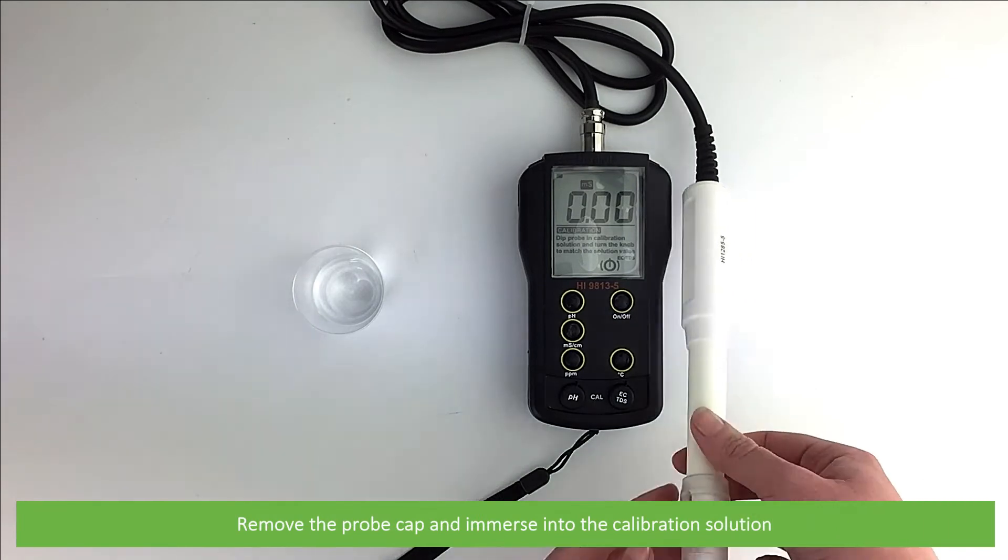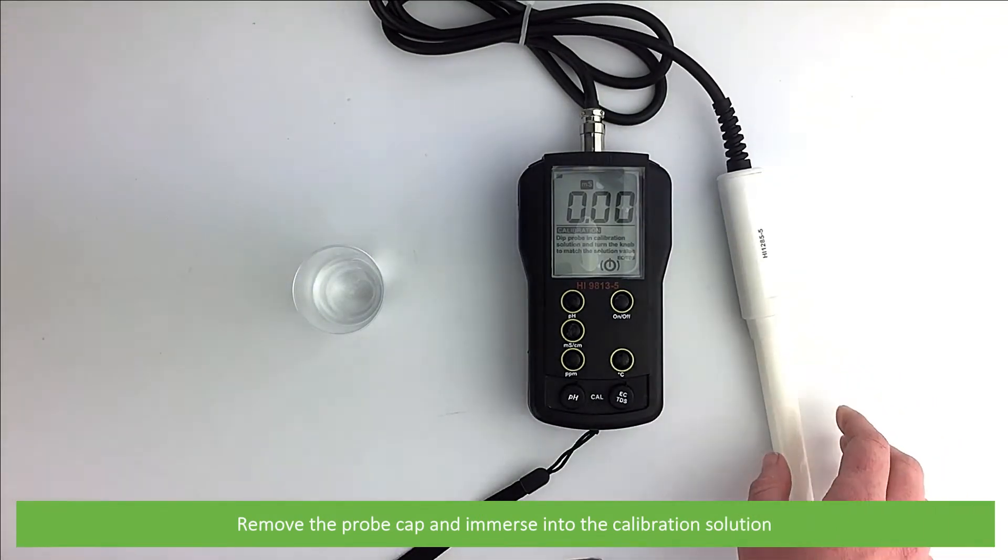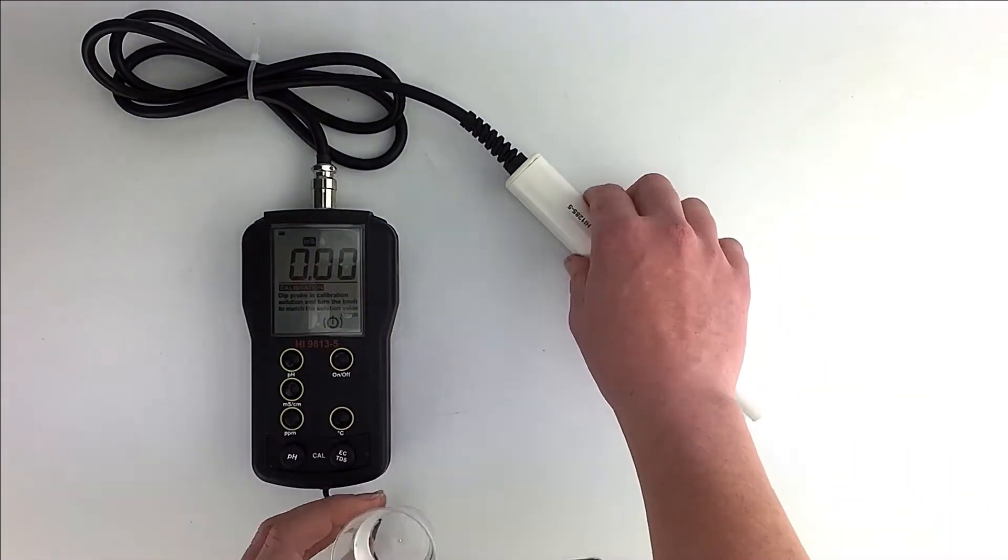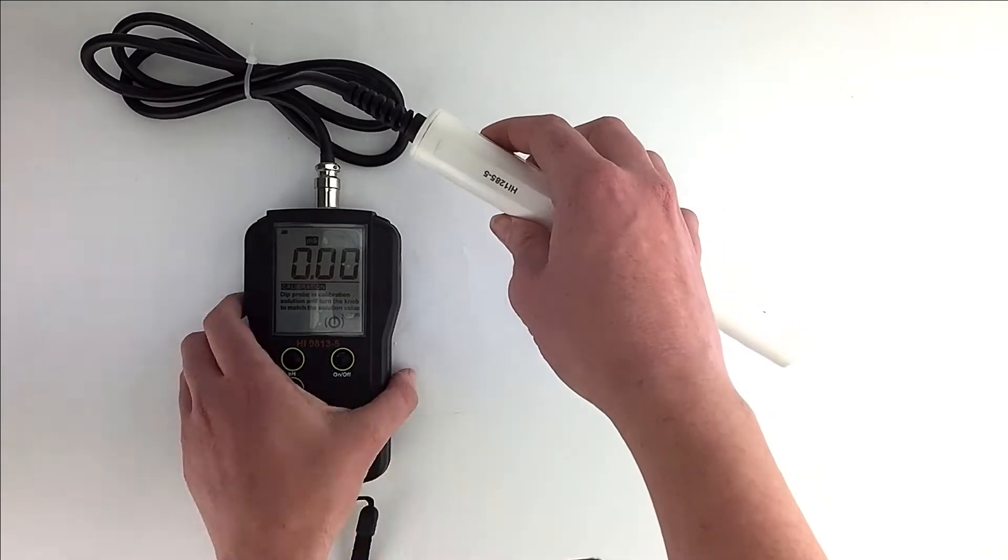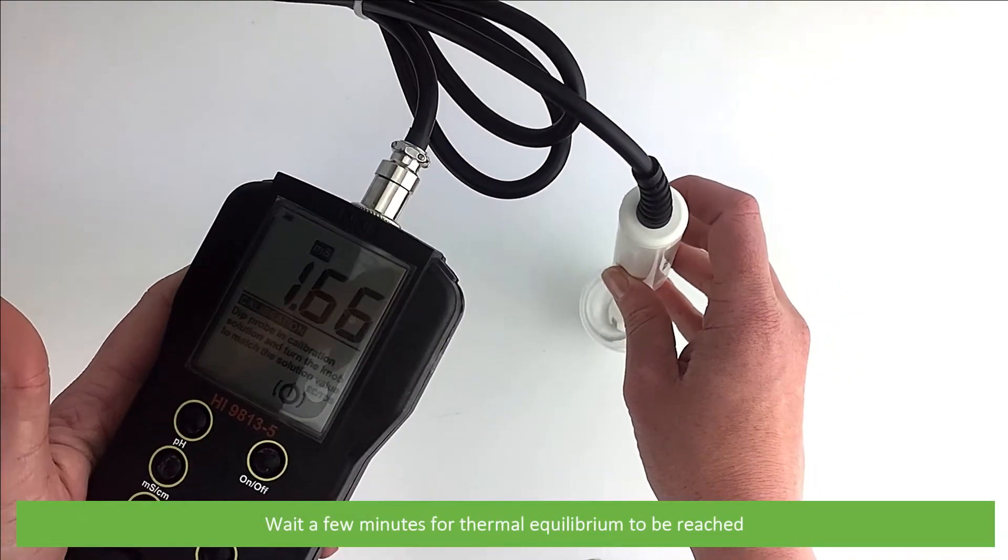Remove the probe cap and immerse into the calibration solution. Wait a few minutes for thermal equilibrium to be reached.